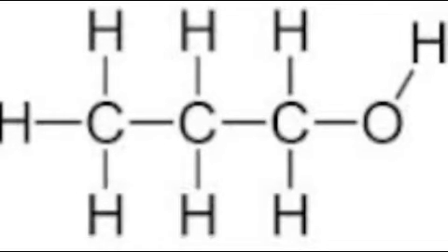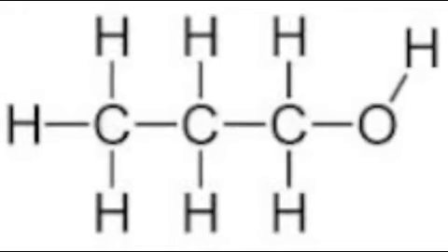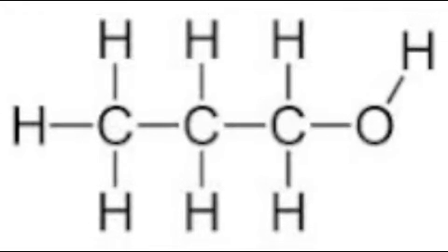The purpose of our perfume lab is to determine the number of carbons in an alcohol that will create the least volatile perfume when it is combined with a carboxylic acid.